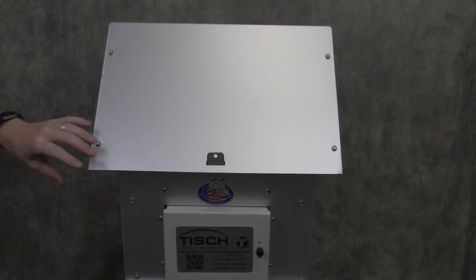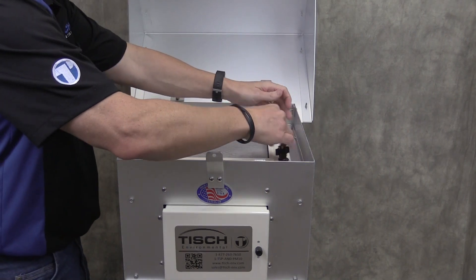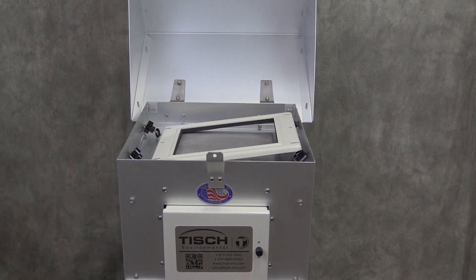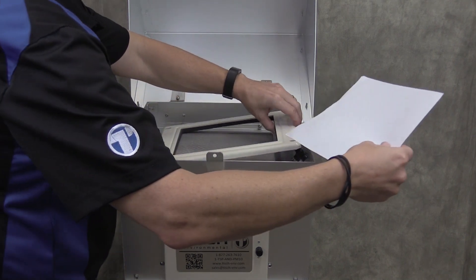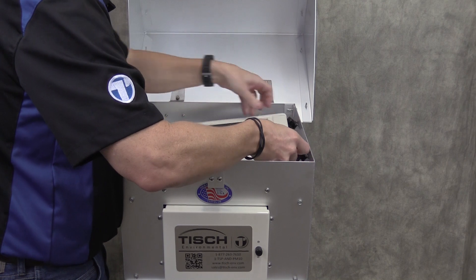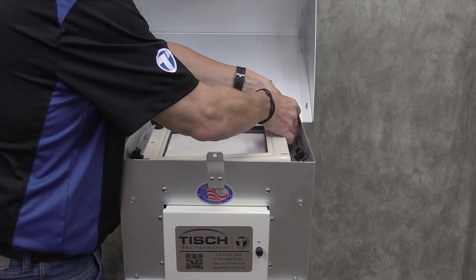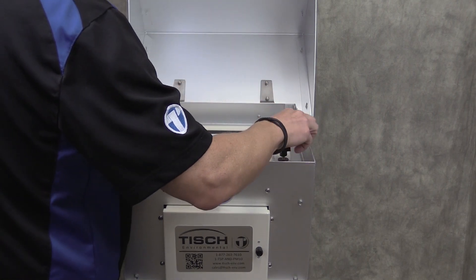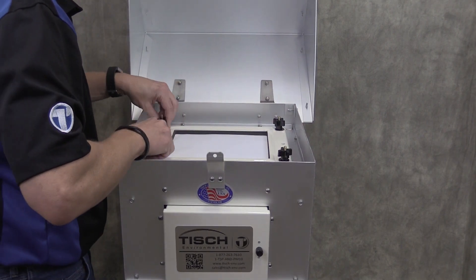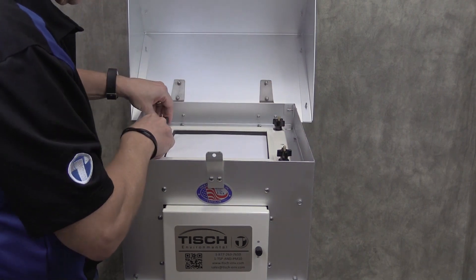We now need to put a new filter on the sampler. Open the lid. Loosen the four plastic nuts and take the frame off of the filter. Get your new filter — rough side normally goes up. Center it on the filter holder. Make sure that the plastic washers are on top and that the filter is centered. Snug the plastic nuts up by turning them clockwise. Close the lid.